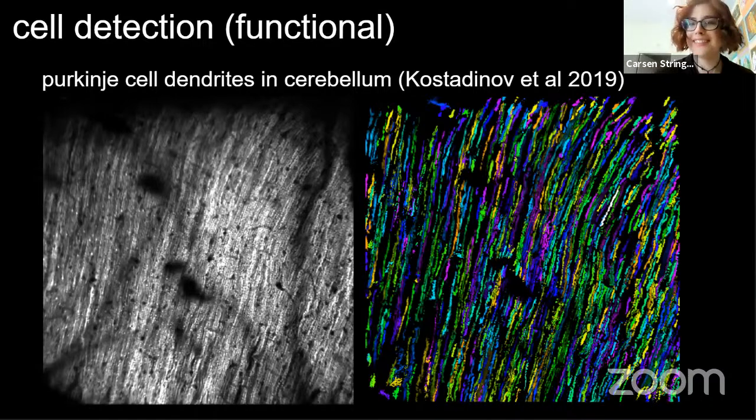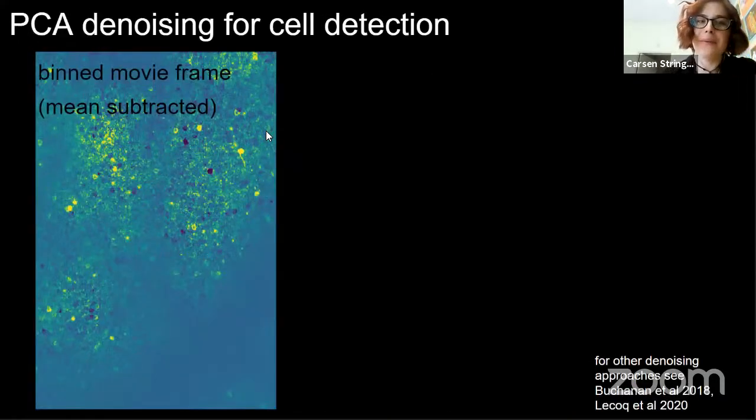Okay, cool. So now here's a new addition from spring, maybe January 2021. We added PCA denoising for cell detection.